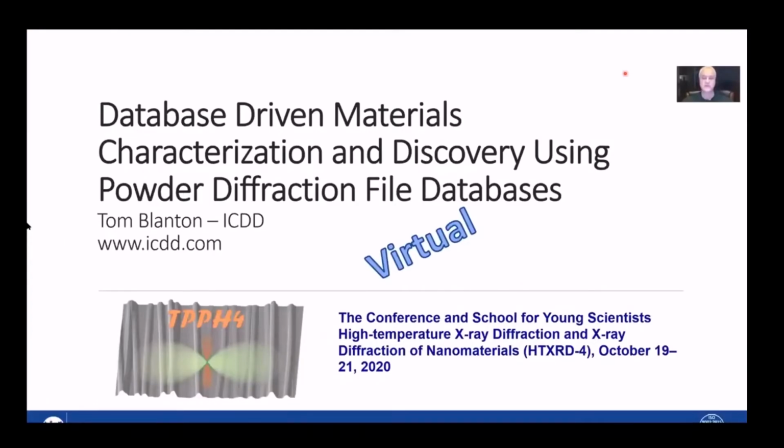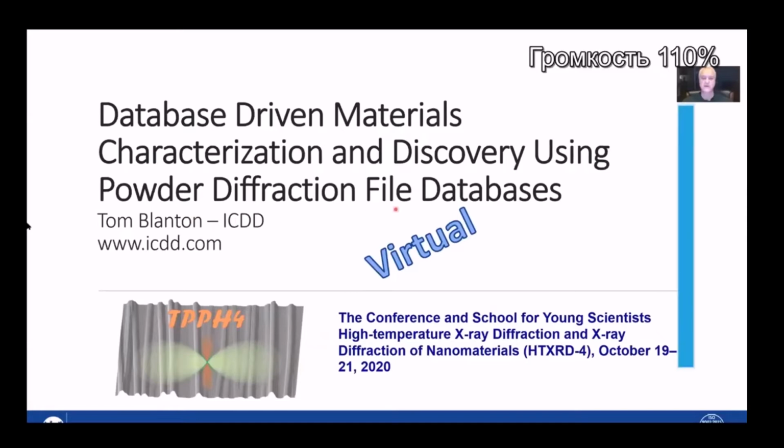Hello everyone, this is Tom Blanton at the International Center for Diffraction Data, coming to you virtually from Philadelphia, Pennsylvania, USA. Today's presentation will focus on using the powder diffraction file for materials characterization.